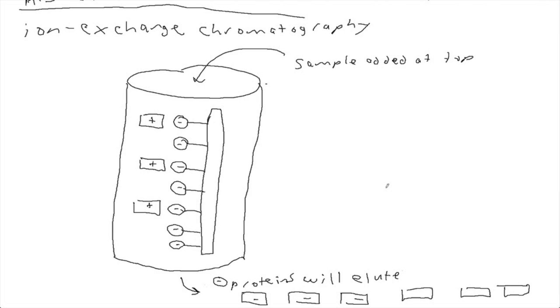In order to purify it, to see which one he's looking for. Well, yes, I wanted you to apply that to the technique we were looking at right here. If you know that a peptide has a net positive charge, you would expect it to get stuck in the column. If you know the protein has a neutral or negative charge, you would expect it to pass through the column. Okay. So this is one type of ion exchange chromatography.